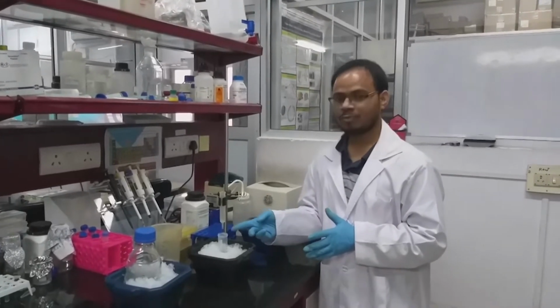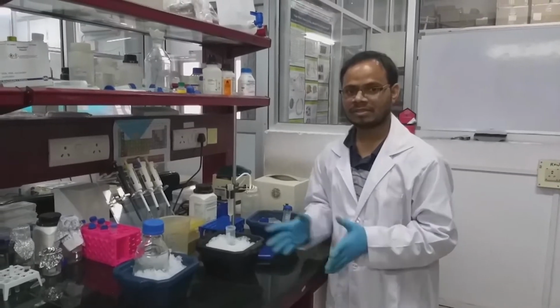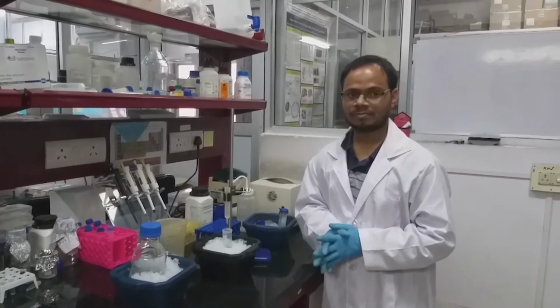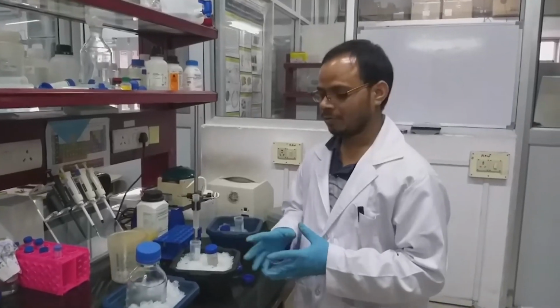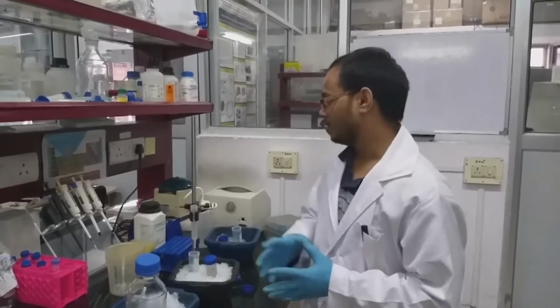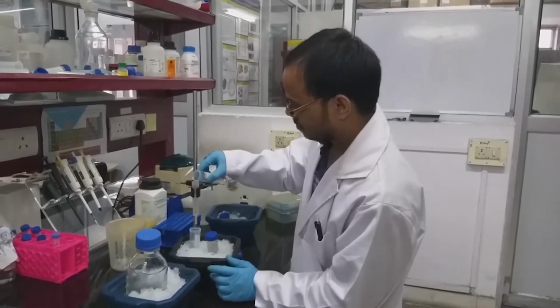So this is a flow through. Whatever we are getting is flow through. In the next step we will wash with the lysis buffer. In this step we are going to wash with the lysis buffer or equilibration buffer. So this is the lysis buffer.